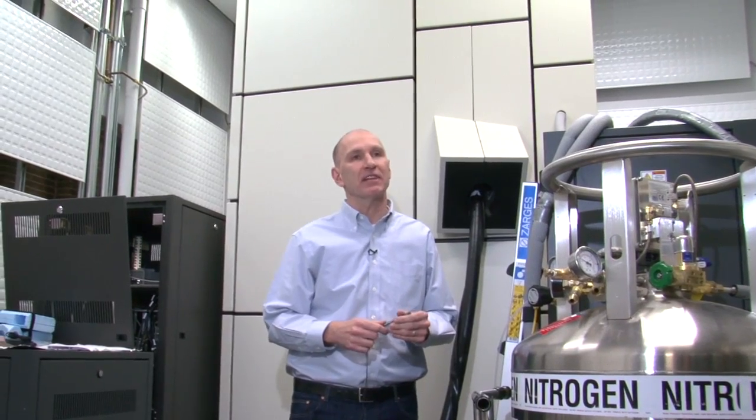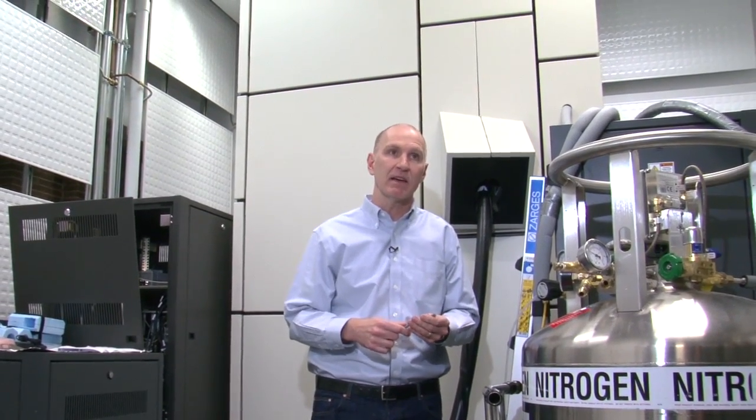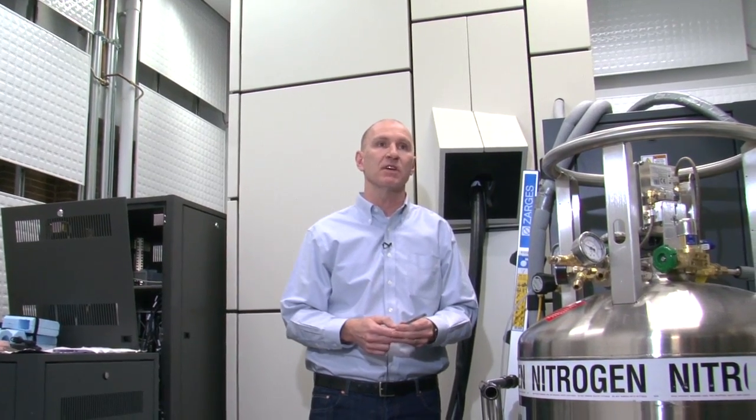Advanced electron microscopes such as this one here, plus the new instrument for which we have received funding from CFI and from Quebec, complement a suite of electron microscopes found in McGill's facility for electron microscopy research.